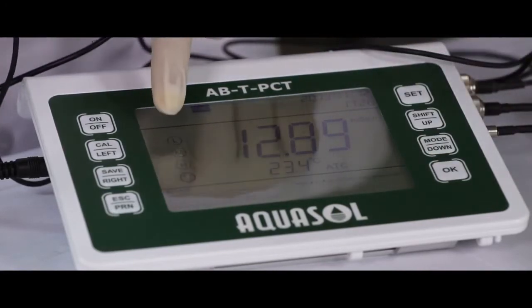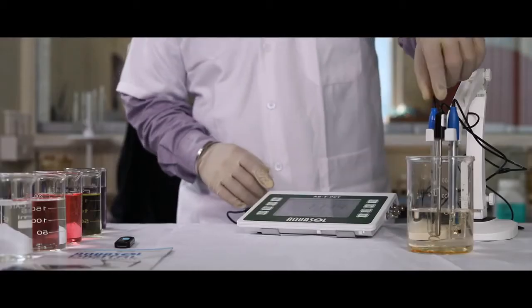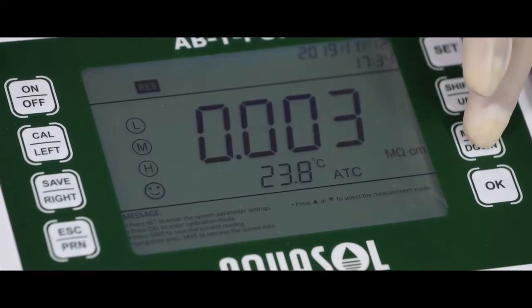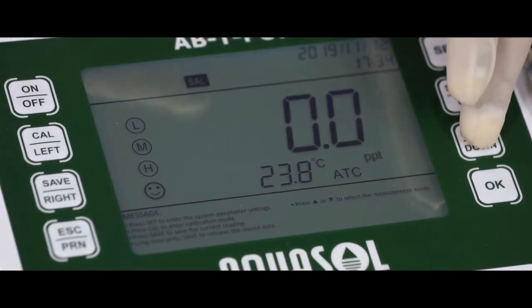L, M, H will appear on the display. Now we are ready to test the sample. Dip the electrodes in the sample solution for reading. Use the MODE key to view the pH, conductivity, TDS, salt, and temperature of the sample solution.